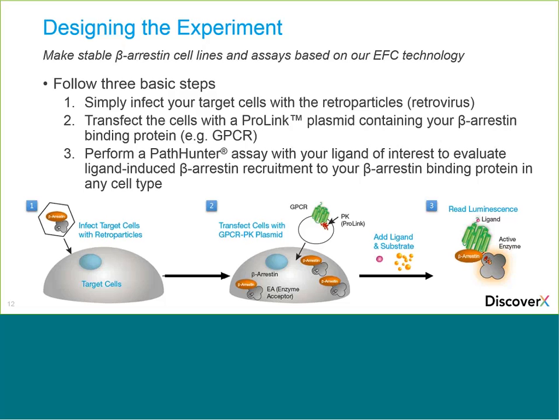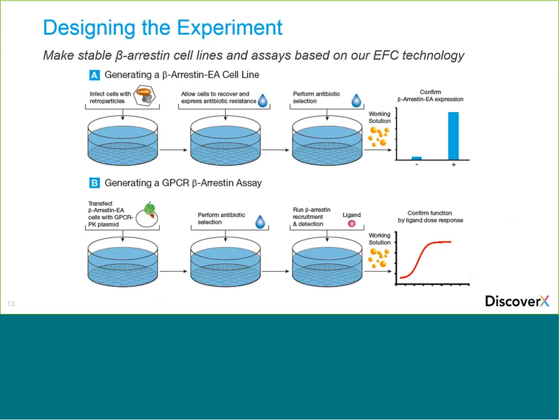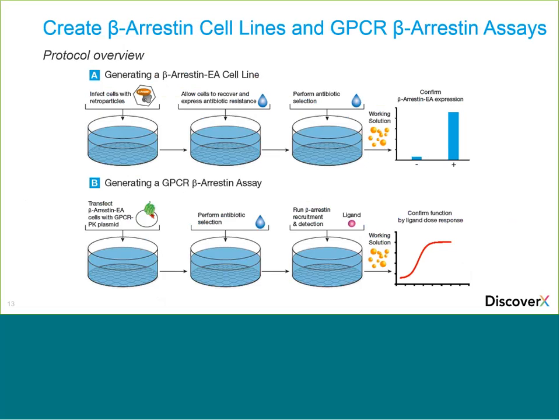You can determine which ligand to pursue as a drug candidate that may have more desirable qualities, such as partial agonists, which may have fewer side effects. Ultimately, you can obtain pharmacological data, which helps you engineer compounds for more desirable profiles, rank your ligands based on potency and compare them to the literature, et cetera.